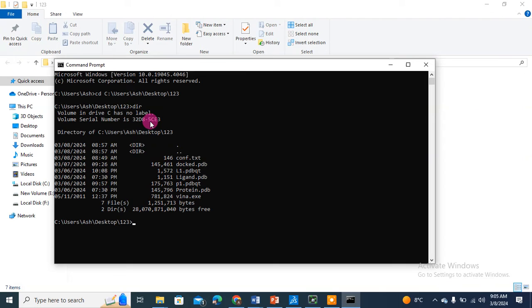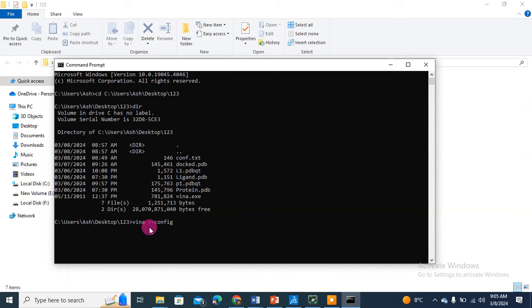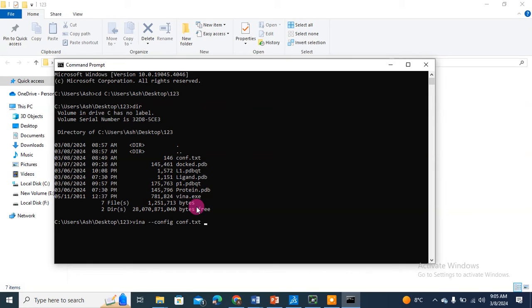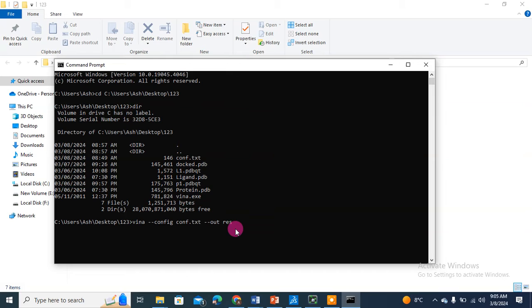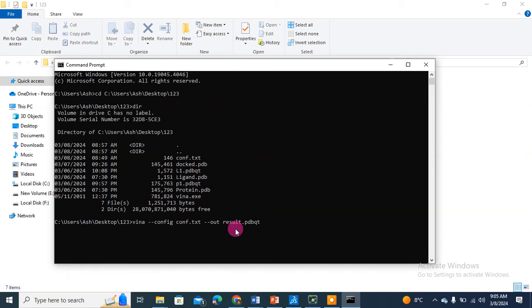Now I will type Vina as we did last time, then --config. My configuration file name is conf.txt. Now for my result file I will write --out, then I will name it result.pdbqt.